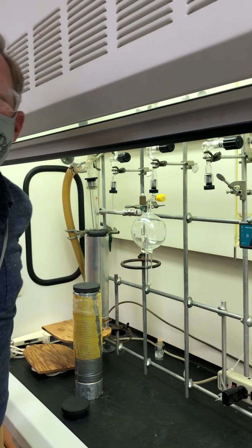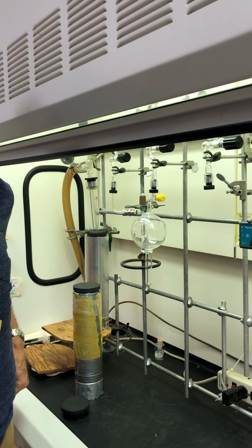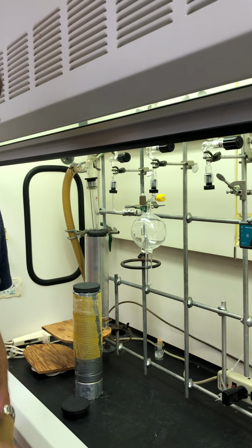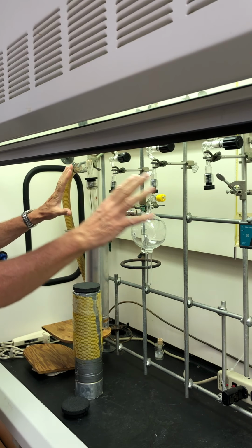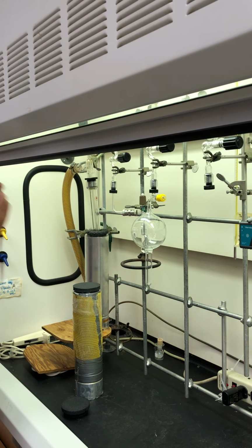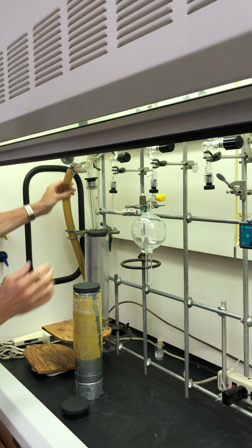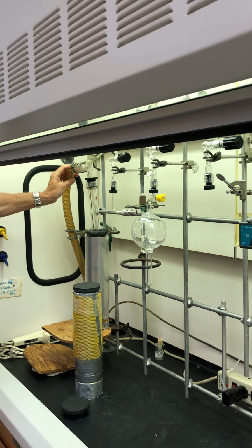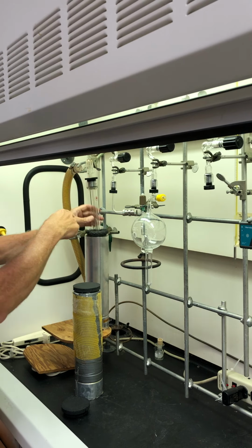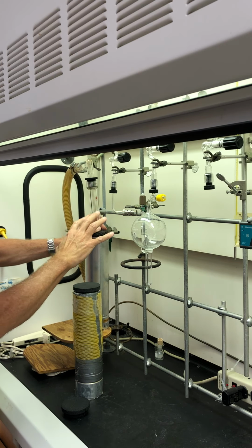Hi, I'm going to have to be kind of loud because this hood makes so much noise, and I want to give you a quick introduction to this glass vacuum line that you're going to use to measure the molar mass. This system is connected to a pump down here, and it goes through a trap that will have liquid nitrogen in it, already put in place for you.